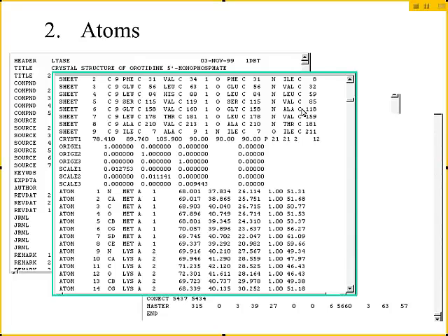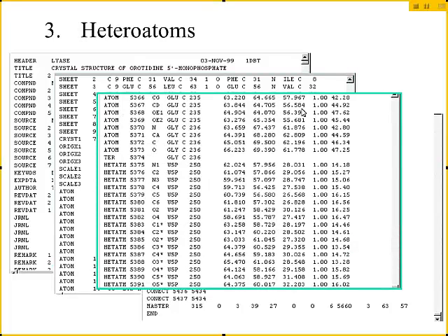And so, but generally the occupancy is one, and then the number that follows after is known as the temperature factor. So molecules sort of move according to their thermal motion, and that electron density is spread out. The higher the temperature, the more that electron density is spread out. So these temperature factors are some measure of how spread out that electron density is, how much thermal motion that atom's undergoing. Now, if that atom's undergoing a lot of motion, there may be no electron density because that atom is not in the same place in every molecule within the crystal. And so there's no density there for those atoms.